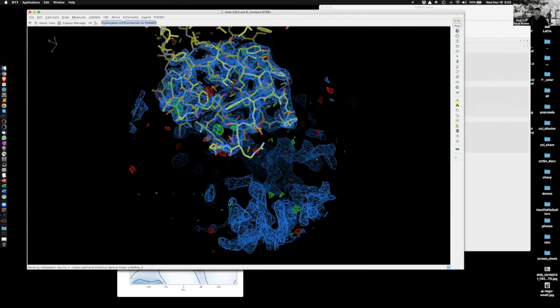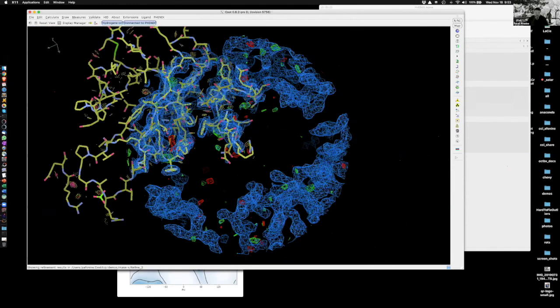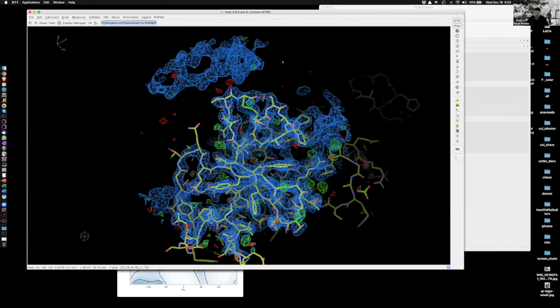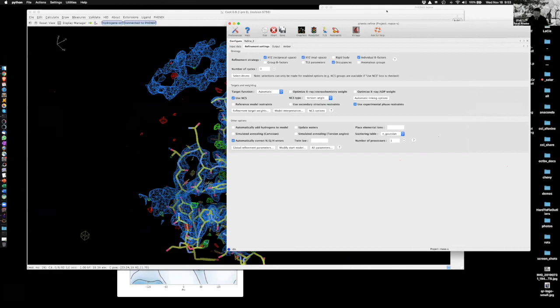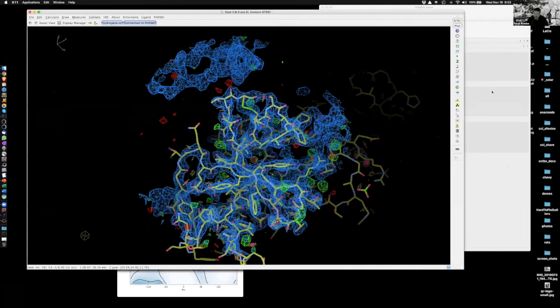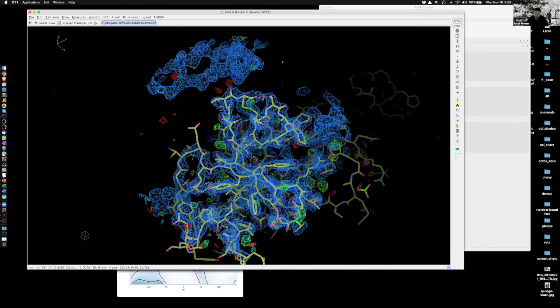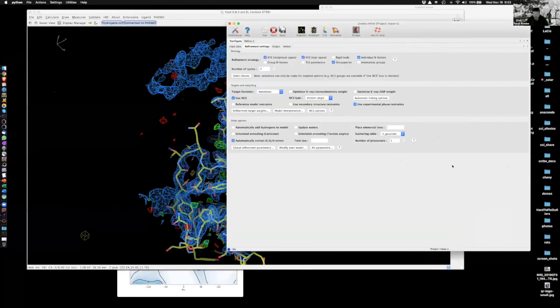So we don't have time right now, but the next refinement run would be to take the structure and run it with water picking. So that refinement places all the waters here. And that may improve the density map, so that you can do more fitting of the protein to improve it. And that's the idea.